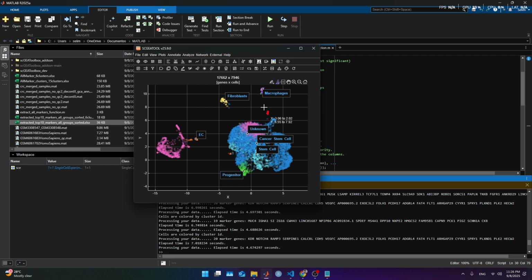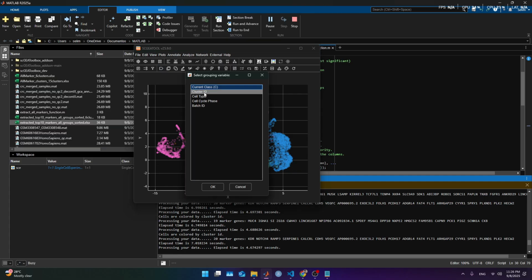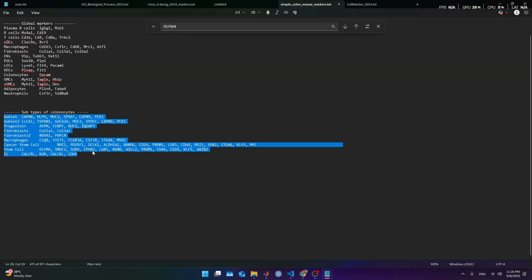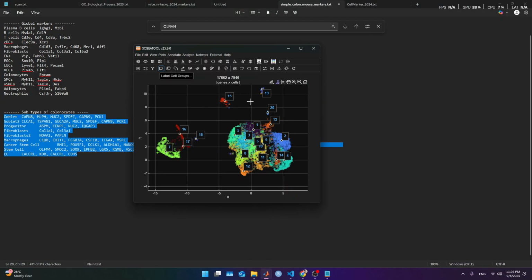So now, for example, here, doing the brush markers and so forth. And this is exactly how we build the cell atlas. And this is finding the markers and annotate. There's one trick more. If I want to hard code assign cells, I can go here and let it know, assign cell types to groups.